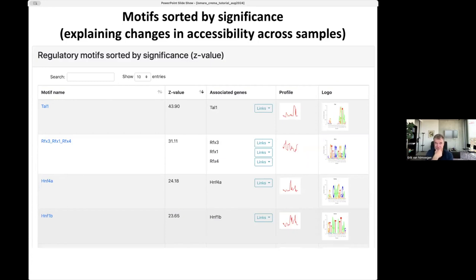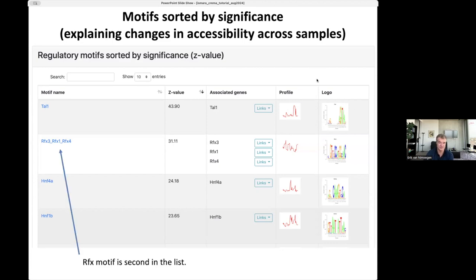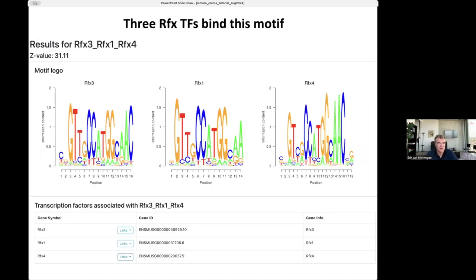Like in MARA, you get a list of regulatory motifs sorted by significance. At the top is TAL1 with a Z-value of almost 44. I'll focus on the RFX motif — associated with RFX3, RFX1, and RFX4 — with a Z-value of 31 standard deviations on average from zero. These three factors bind very similar motifs. There are links to information about these genes.